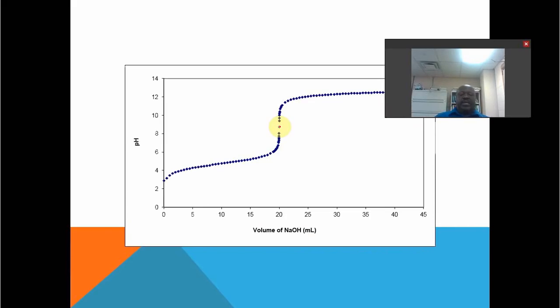All right. So let's look at a titration curve. First, what is a titration curve? In this case, it's pH on the y-axis versus volume or milliliters of the sodium hydroxide base for the first two titrations. Sodium hydroxide, HCl, sodium hydroxide, and acetic acid, sodium hydroxide. In the other case, it will be pH versus milliliters of the HCl. So that's a titration curve.